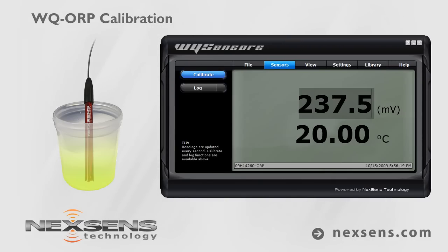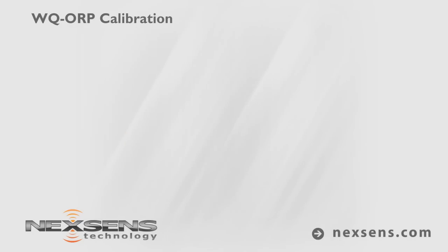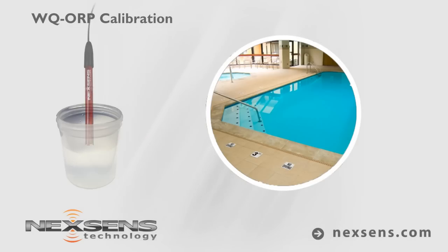Adjust the reading to the appropriate ORP value at the corresponding temperature and press enter. Calibration is complete and the probe is ready. Immerse the probe in the pool water sample. Gently stir the sample with the probe.